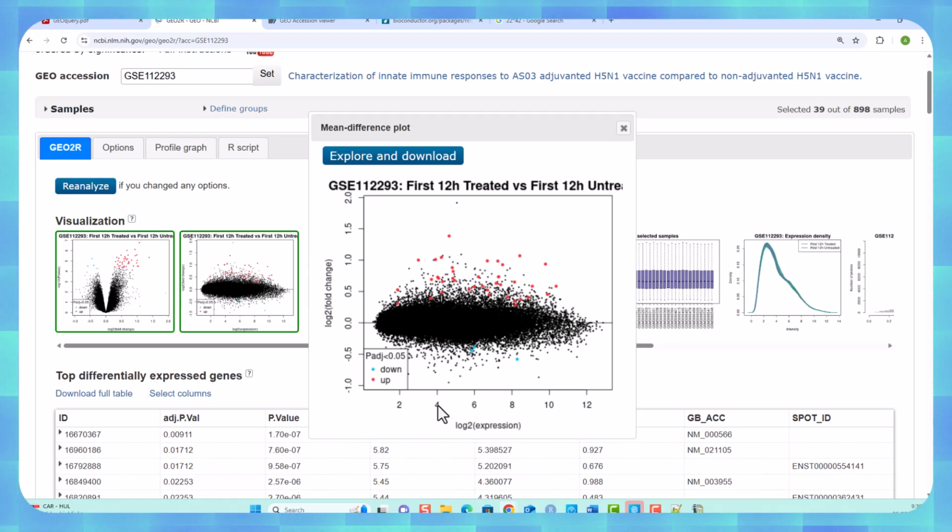So here, because it's all in base 2, here you've got 16 units, here you've got 64 units, here you've got 256 units, here is going to be 1024 units. So they're all in powers of 2.